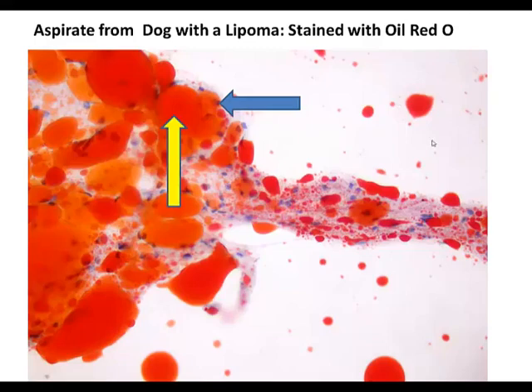Some of the smearing here that you're seeing, these blobs that are not surrounded by a cell membrane and don't have a nucleus, these are just bits of fat that have been lost through a ruptured cell membrane onto this preparation here. But I just thought you might like to see an example of another type of stain which does highlight the fat in this example.